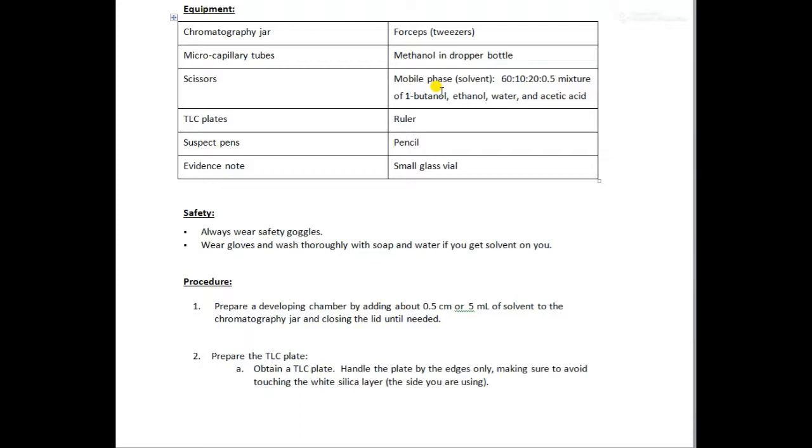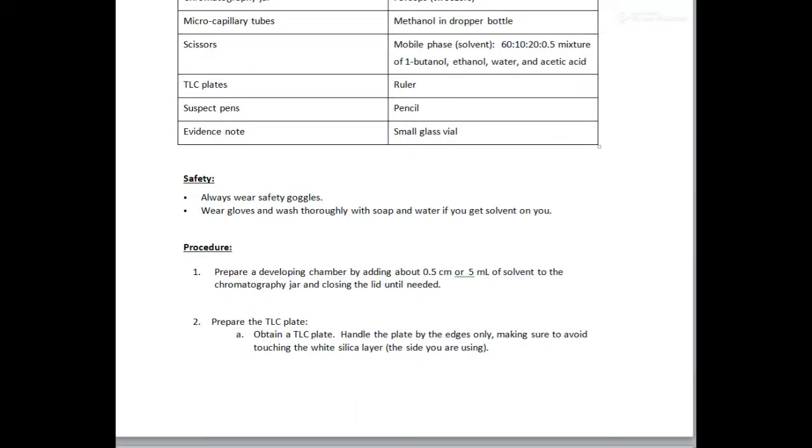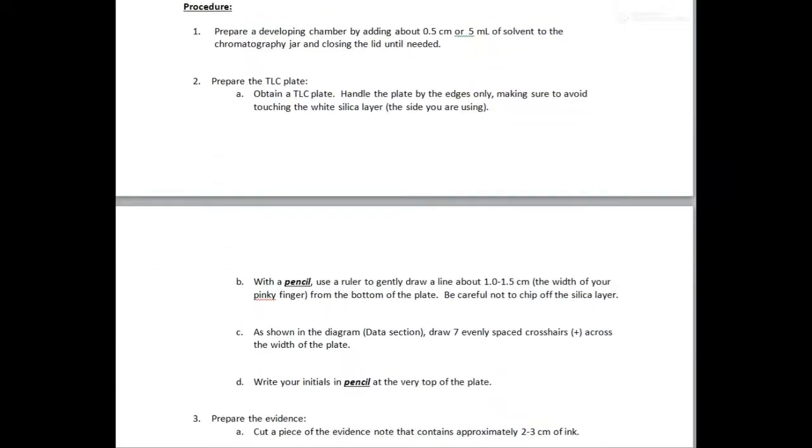Silica is a bone breaker. So when you're working with TLC, do not touch it directly. Wear a glove while you're using a silica plate, and do not touch the white silica, especially the side which you are using.